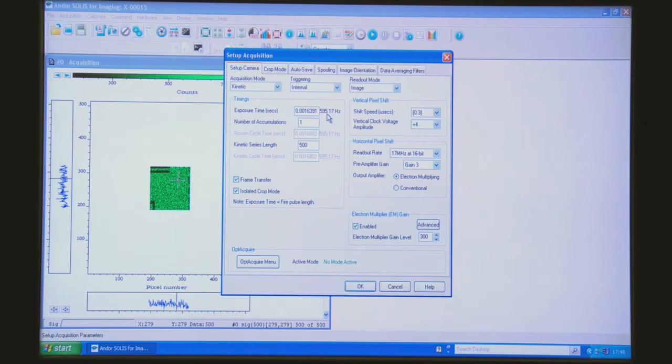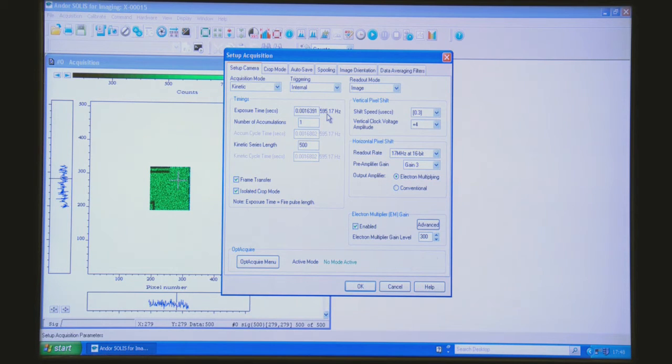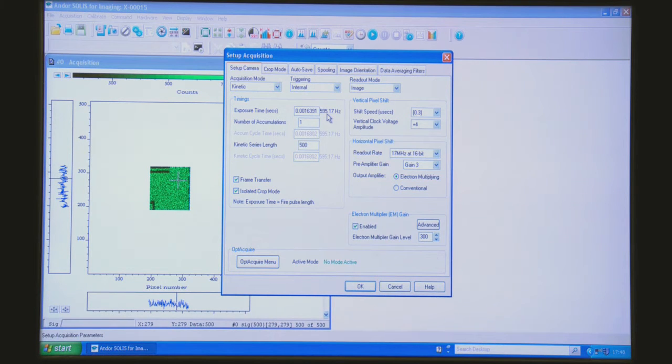Now there is a condition of using crop mode which is that you have to optically shield off the part of the sensor that you're not interested in.